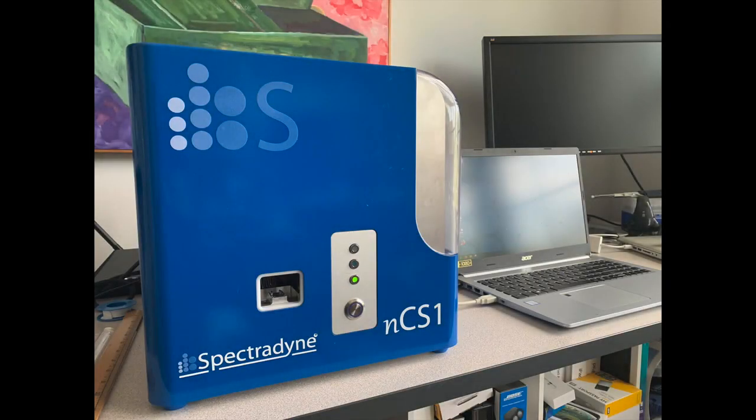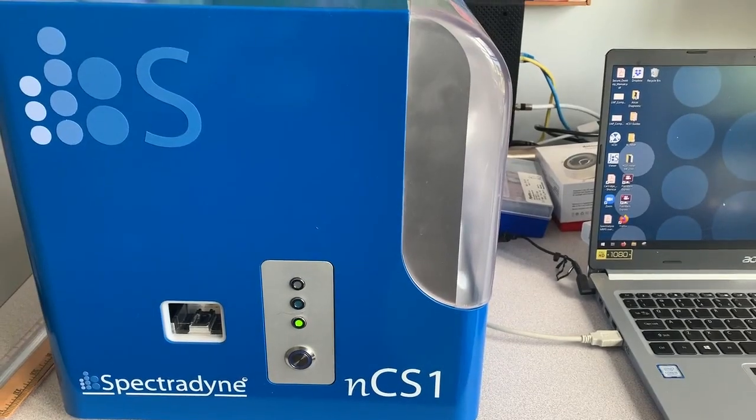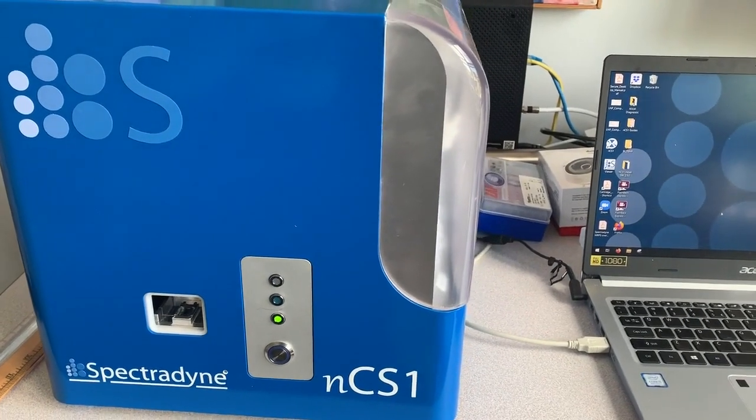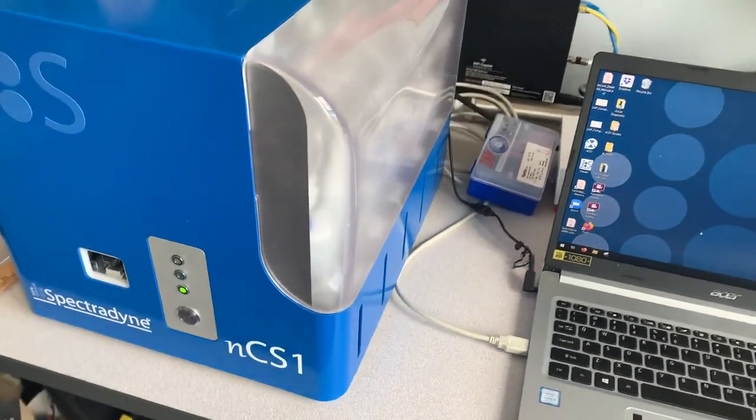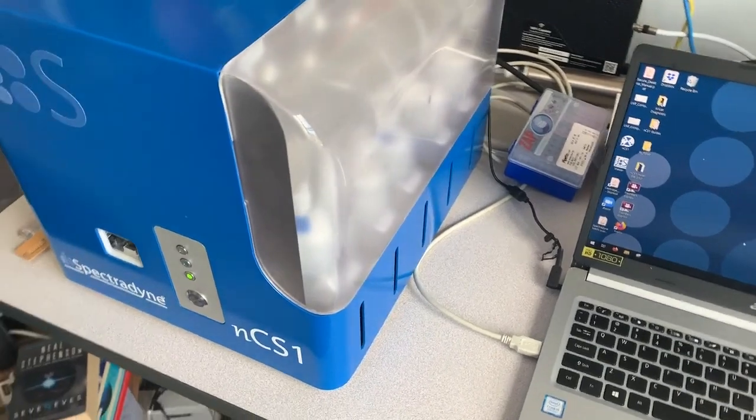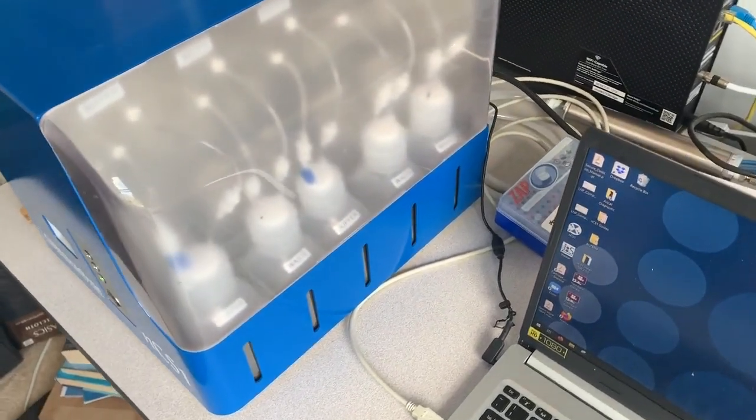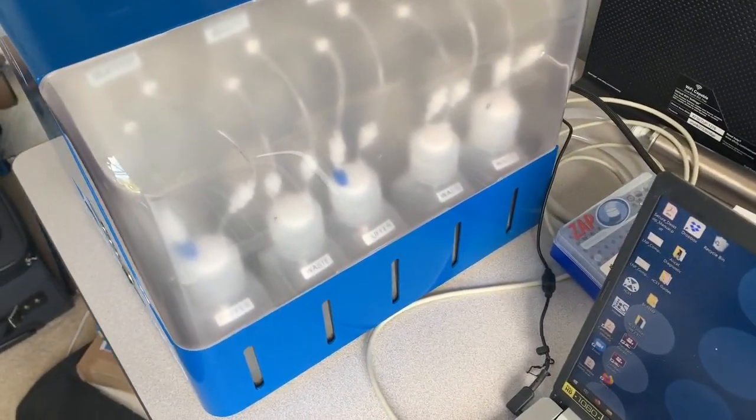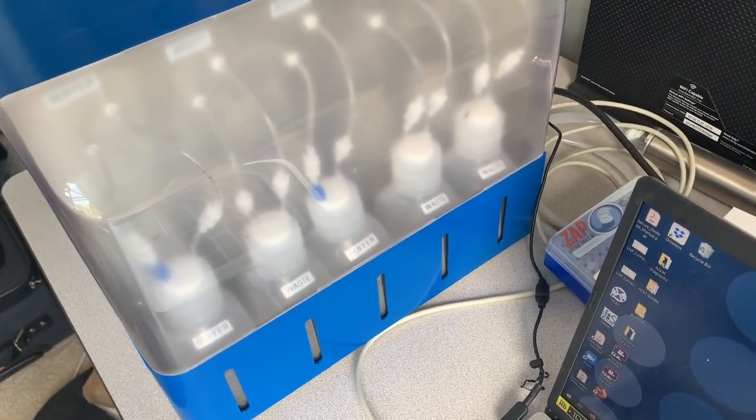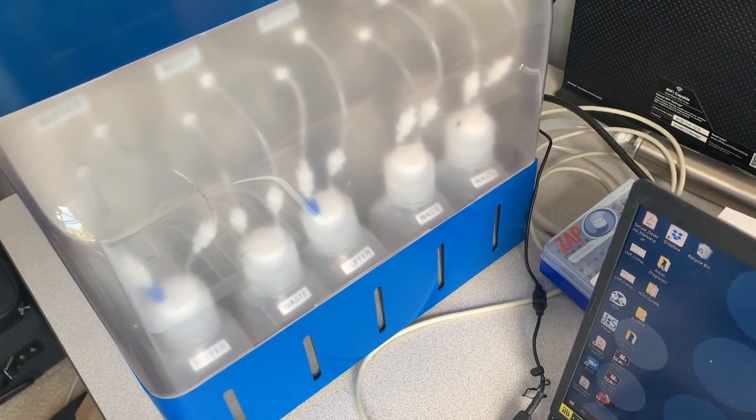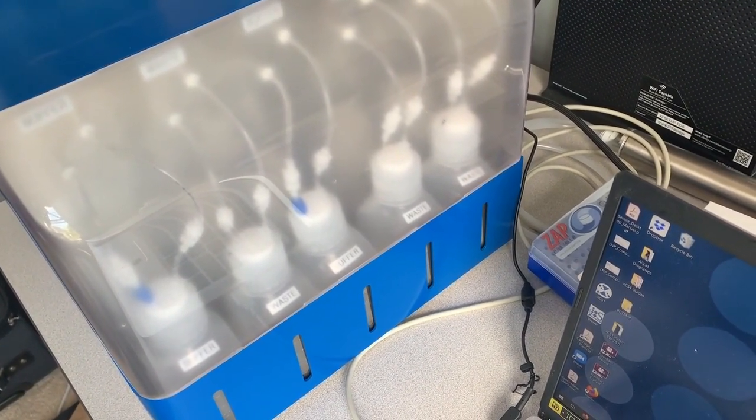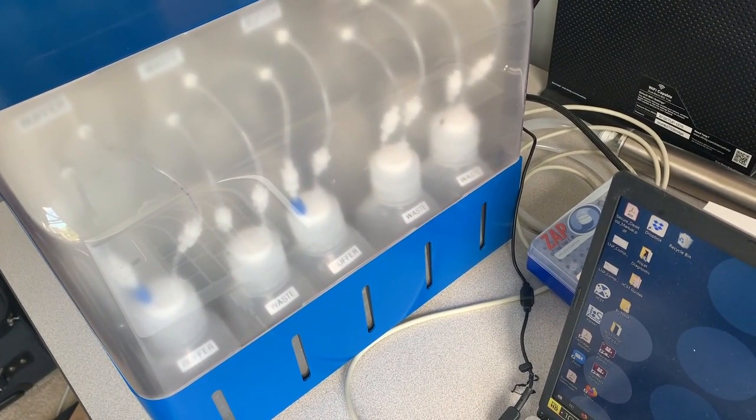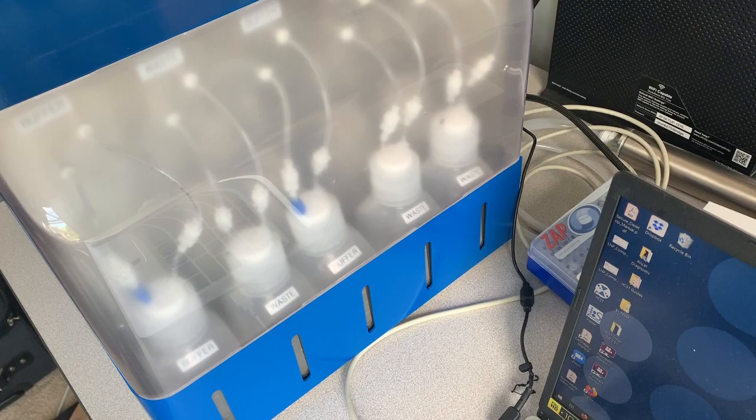As you can see, the NCS-1 unit itself is very compact. It measures just 13 inches wide by 15 inches deep by 13 inches high. The unit itself has three connections at the back. There is power, USB out to the computer itself, and there's an air input for the air input unit, which is merely bringing 15 psi into the unit itself.